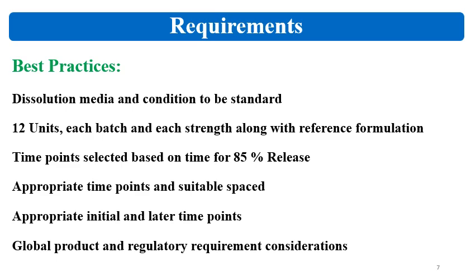Then appropriate time points should be selected, and these time points should be suitably spaced. Appropriate initial and later time points should be selected. Coefficient of variation and relative standard deviation should be considered with reference to the initial time points. So these are required to be considered.